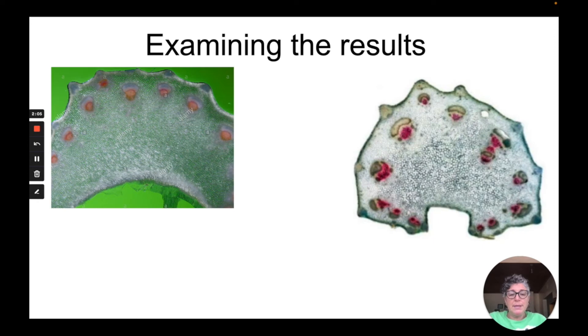If we examine the results of this experiment a little bit more closely we will see the vascular bundles of the celery. I've just circled some examples here.